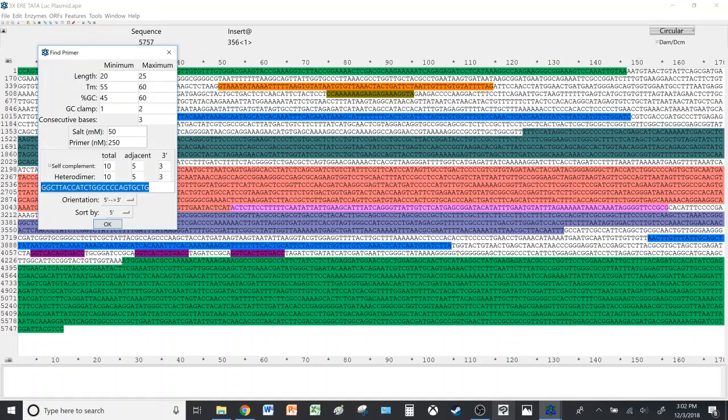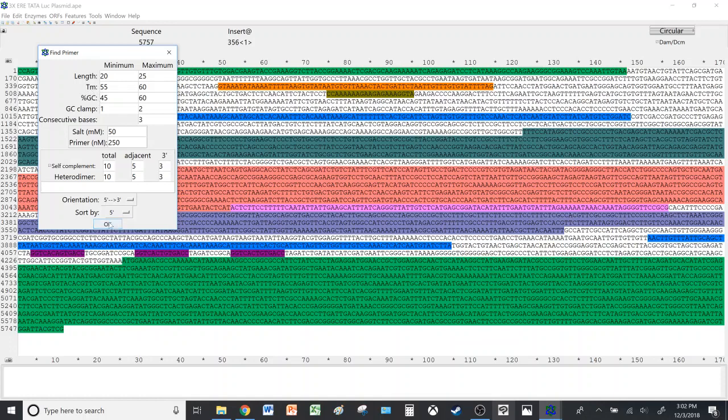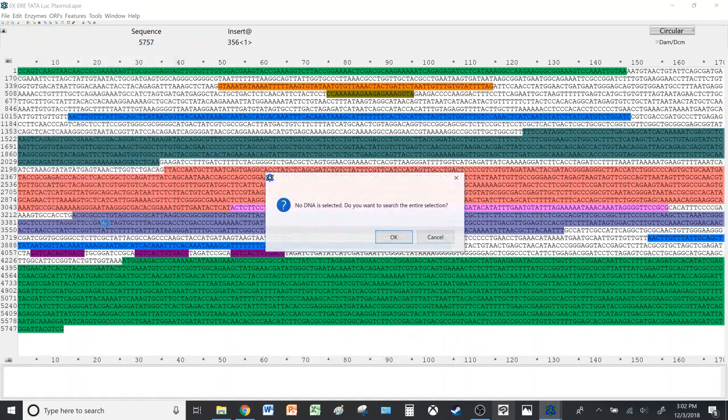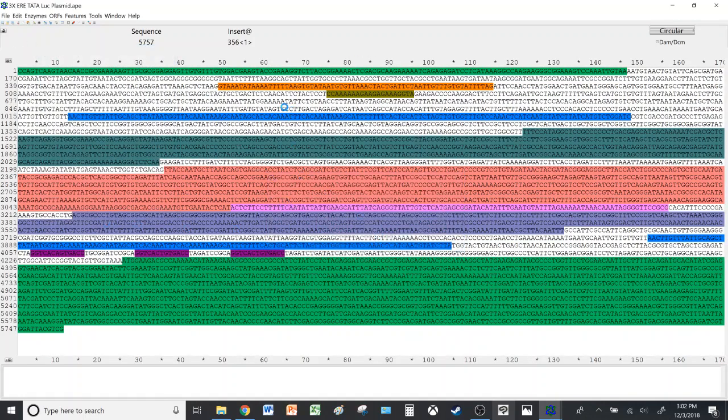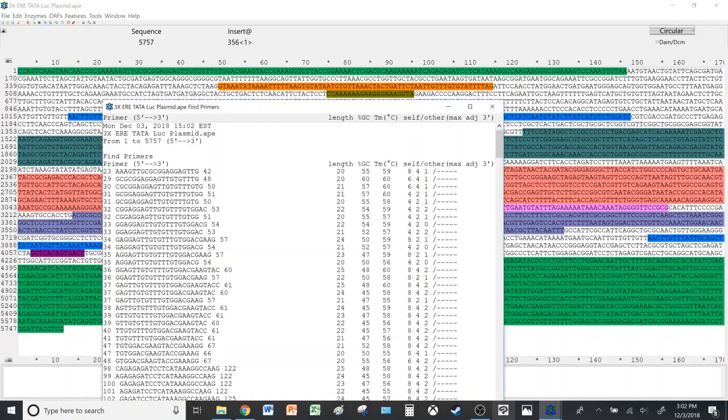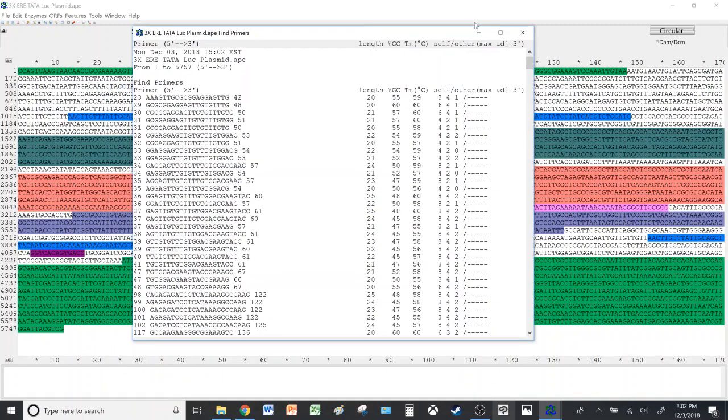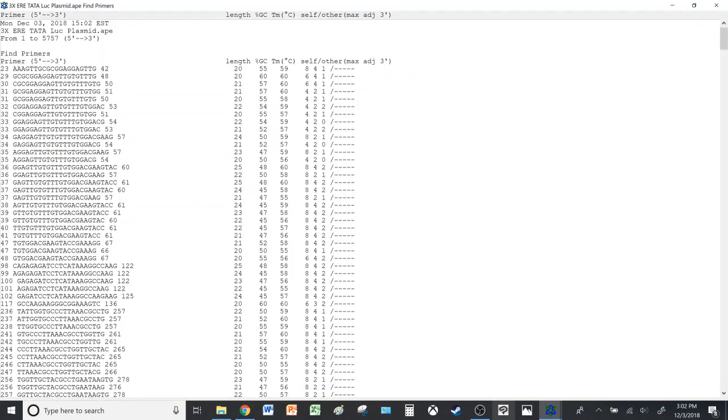Here you can look at a certain sequence and adjust the length of the primers you would like, as well as the melting temperature and the GC content. We'll just have the program look for primers at various locations.